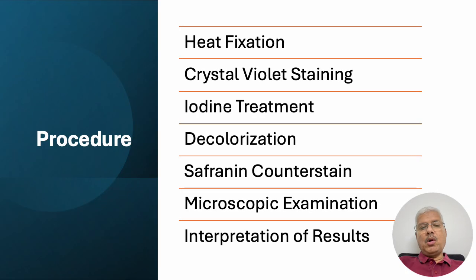Different steps involved in the gram staining technique are heat fixation, crystal violet staining, iodine treatment, decolorization, safranin counterstain, microscopic examination, and interpretation of results.